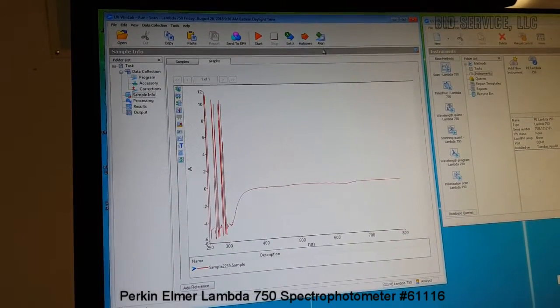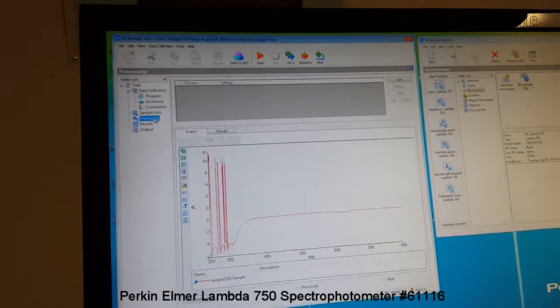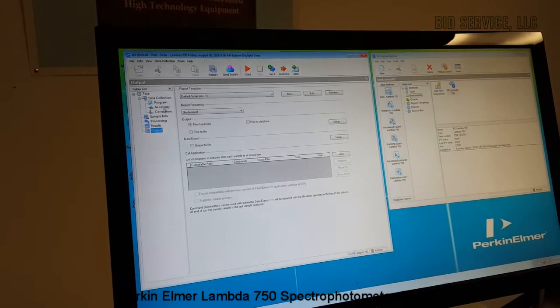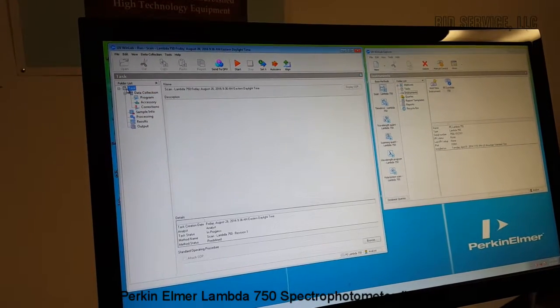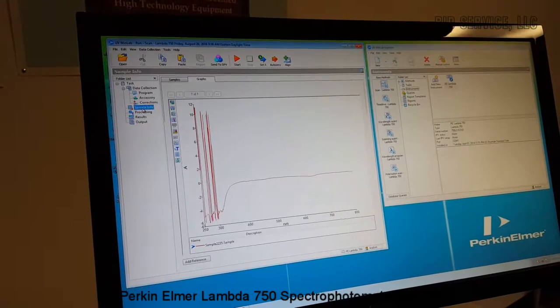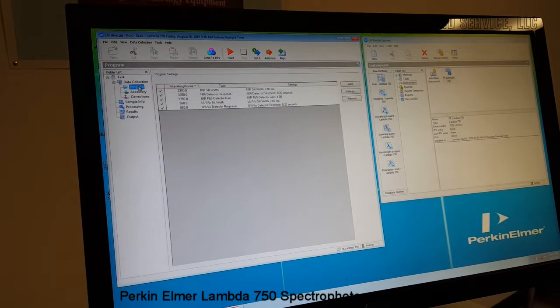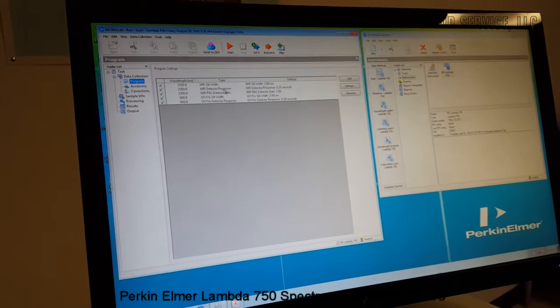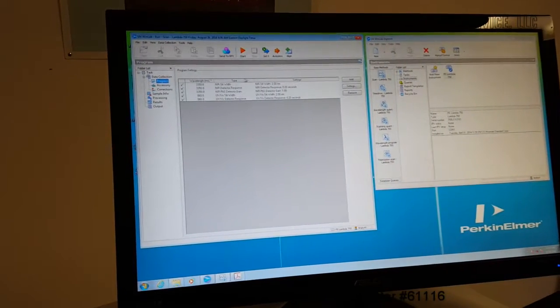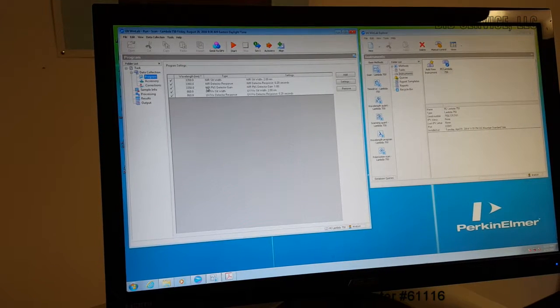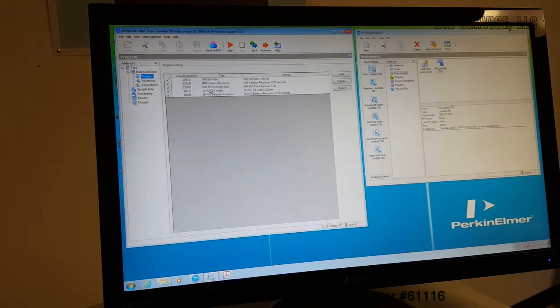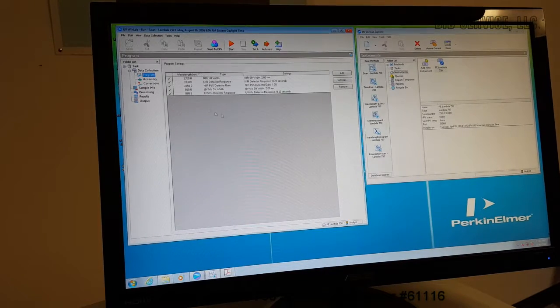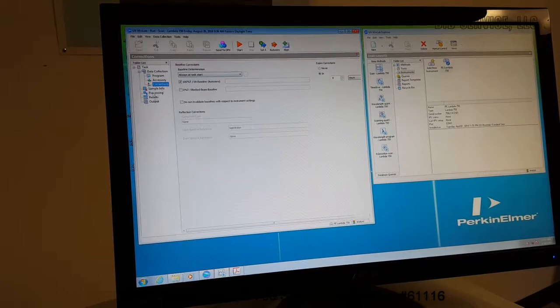So I'm going to select a new sample here. Various displays are here, such as the NIR slit width is selected, and NIR detector response and near infrared lead sulfide detector gain is selected. So all these program parameters can be adjusted, and any corrections if necessary.